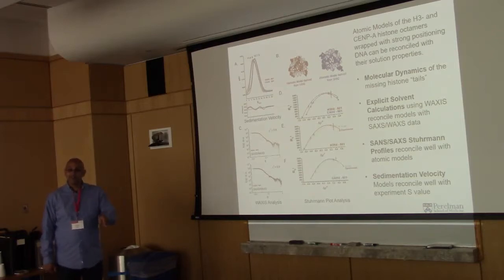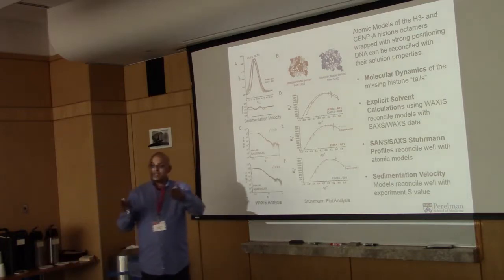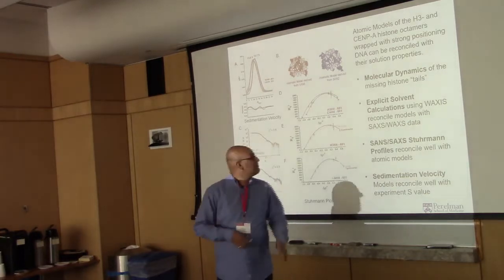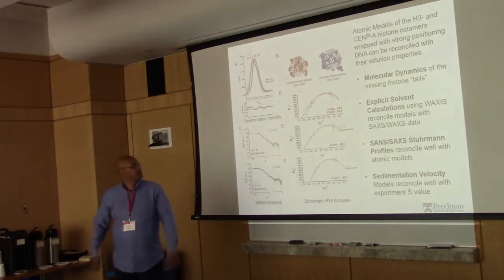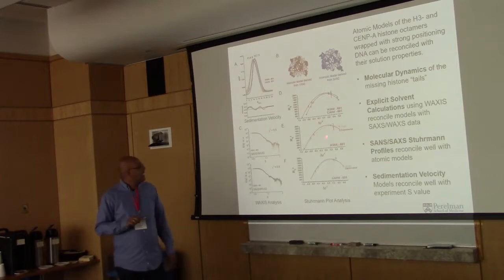the people who originally did these experiments, working on the reactor, said that's fantastic. I asked why. Because back then, they couldn't reliably get some of these wing points, these contrast points, because they were dominated by incoherent scattering. The technology has advanced so much over four decades that now, with the available flux and detector technology, you get much better determinations of these harder to get contrast points, the wing points. So this parabolic nature is for real.